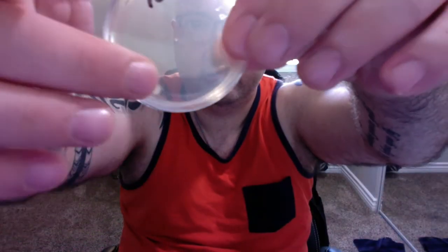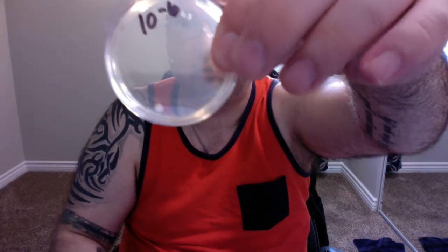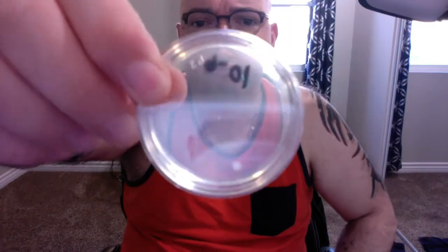And then lastly, dish number 6, I don't know if you can see here. Well, you can. There's a bit of cloudiness right at the bottom of the dish where I have my finger up. So that might be maybe 1 or 2 colony forming units per mil. But not much else happening here.